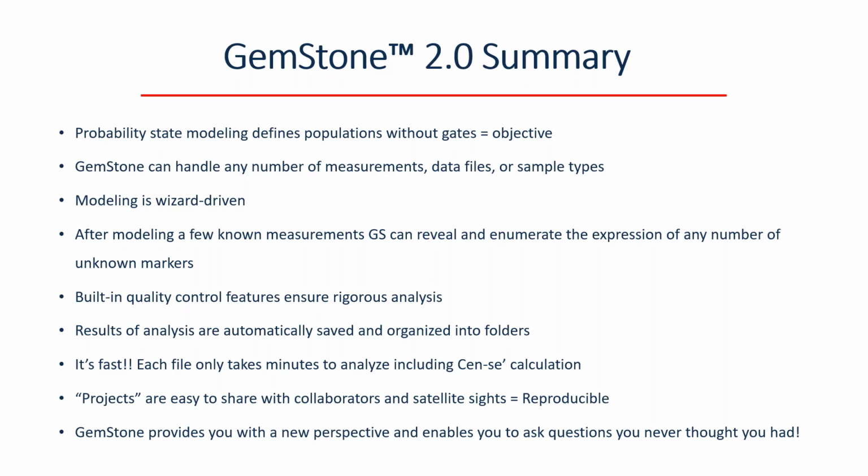The project format makes collaborations very easy. You can share the whole project with your collaborators. Your analysis is secure and at your fingertips. And thank you very much. And thank you, Cytek, for the opportunity to talk today.